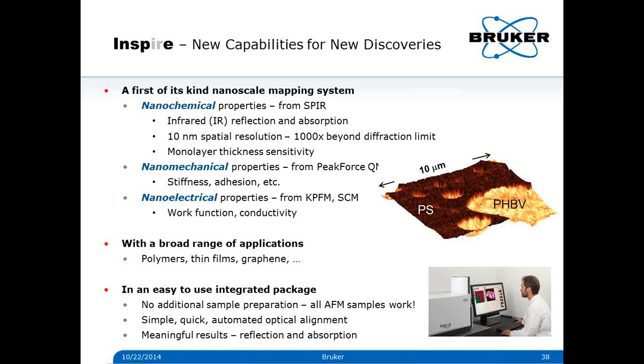Also for this pentacene film, which is only a few nanometers thick, you have sensitivity to each layer. So from that point of view, you can really image and distinguish materials that are very thin, and you get nice contrast with our technique in reflection and also in absorption. So even if your sample doesn't show absorption in this range, you can still distinguish different layers just by looking at the reflection that changes with the number of layers.